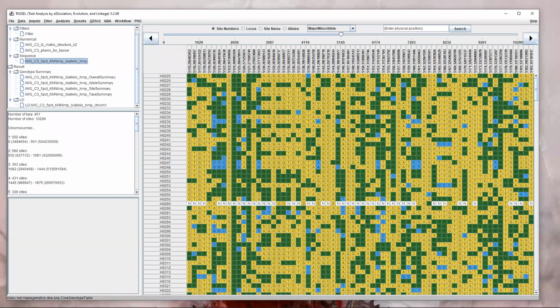I was wondering if there would be a reason to use sliding windows of different sizes versus the full matrix LD calculation. I don't understand the benefit of one versus the other besides saving processing time. Yeah, I think that primarily is it. A second, also important reason is that if you have a big genotypic data set that has not been filtered for SNPs located very close to each other, and you implement a sliding window, it's going to look at those different windows, and you'll have a more meaningful relationship calculated.